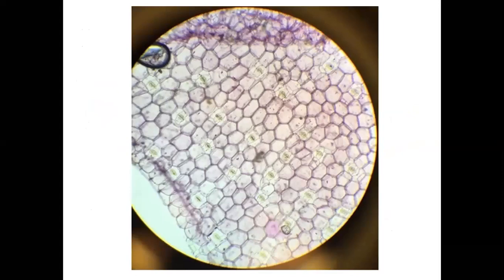You see, unless number one, you know what are stomata, you may have a challenge. Like in this case, I can just point them. This is a stomata. This is another one. The one that I'm doing in green. There are quite a number. This one, this one. Most students now will complain, I can't see, I can't see. So if you can identify, then you can count.